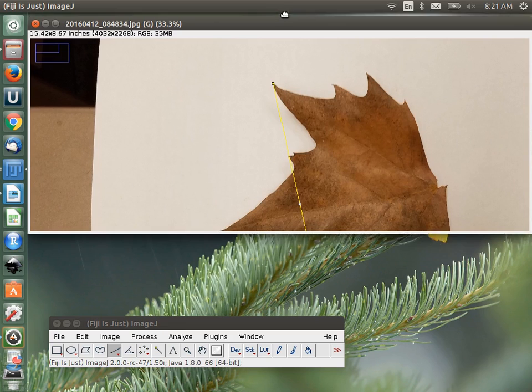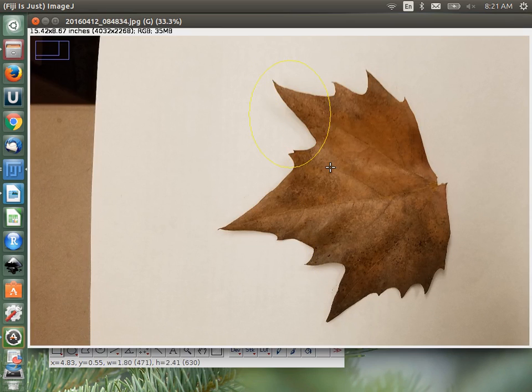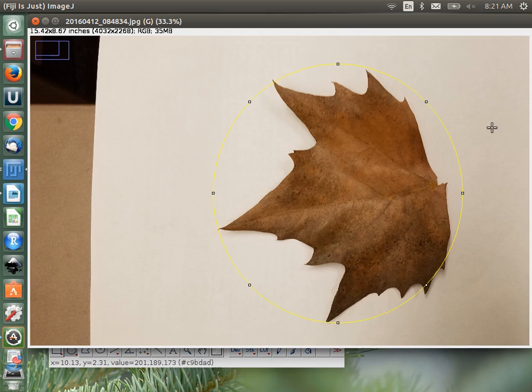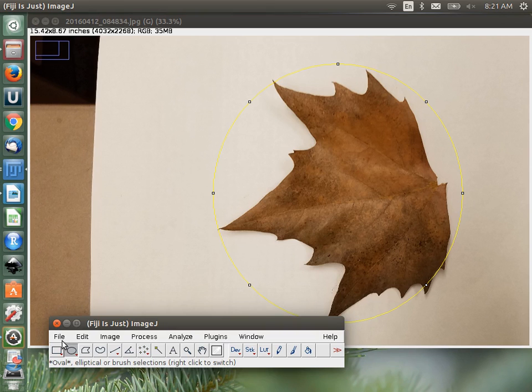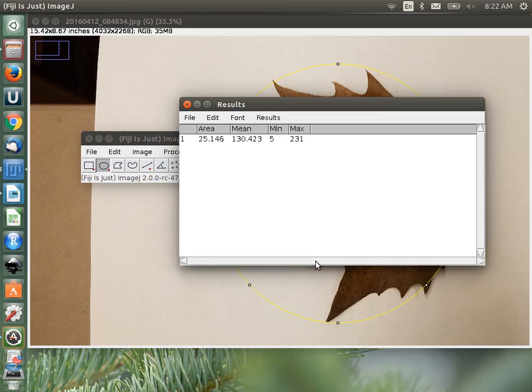We can also get areas with box or ellipse selections. For instance, I can draw a circle that encompasses a leaf to get an approximate area — though it's a rough estimate and oversized. Going to Analyze > Measure, it tells us the area of the circle circumscribing the leaf is 25.146 square inches. It also gives the range of intensities within that selection — between 5 and 231.